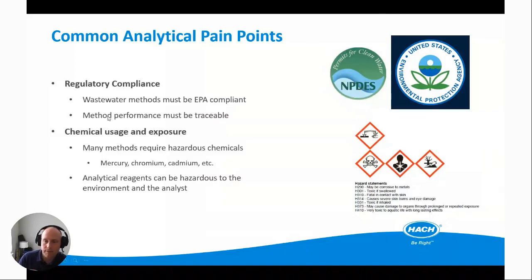Also, the method performance must be traceable. There needs to be very good data integrity around all the metadata of an analysis, like who is the operator, when did they run this sample, what was the condition of the reagents, which lot was used, and are they expired. All that needs to be accounted for in a comprehensive fashion, so that we can demonstrate that the measurement was taken in a compliant way.